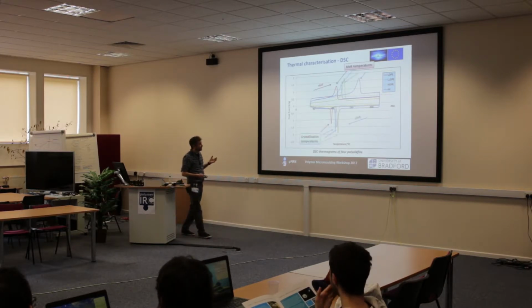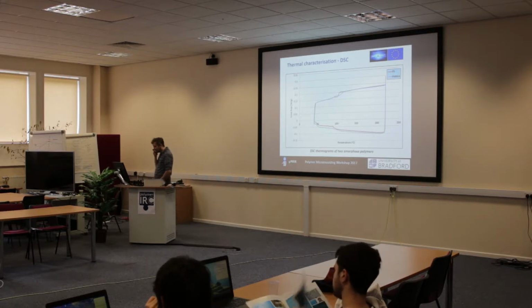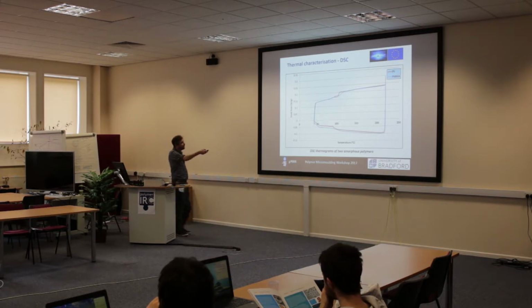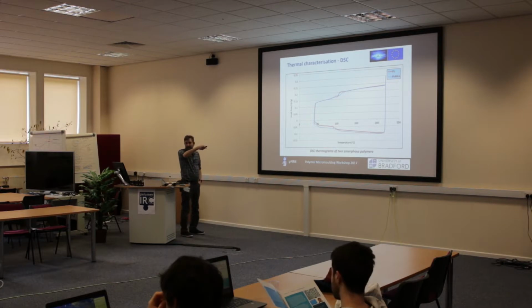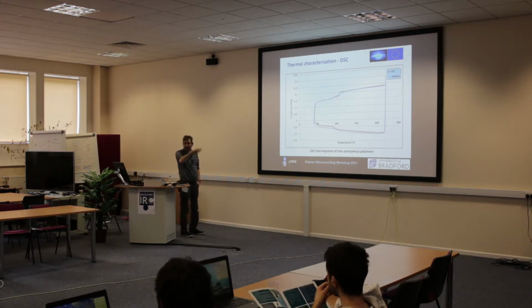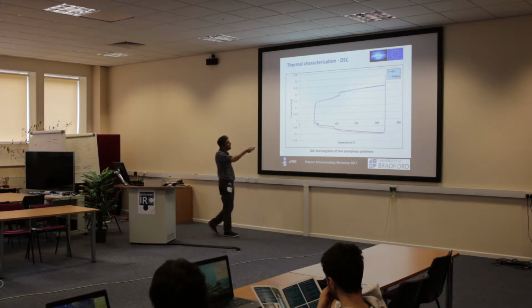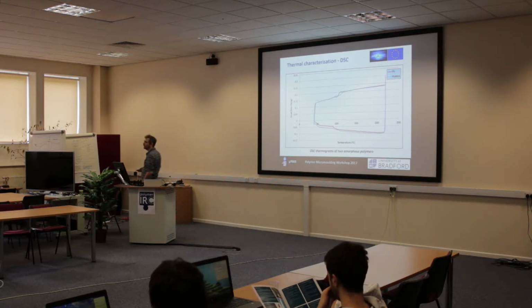Heat, cool, melt temperatures, etc., crystallization temperatures, okay? Now for an amorphous material, this is what the thermograms look like, okay? We've got a polystyrene and an acrylic, okay? No melting peak anywhere, okay, because there are no crystals within there, okay? So you can't take that. But what you can get is a different transition, and this is known as the glass transition temperature, okay?